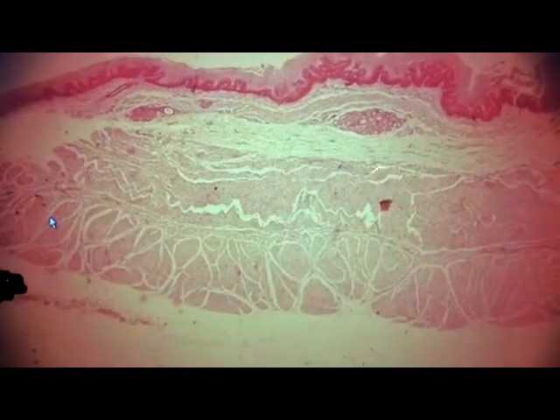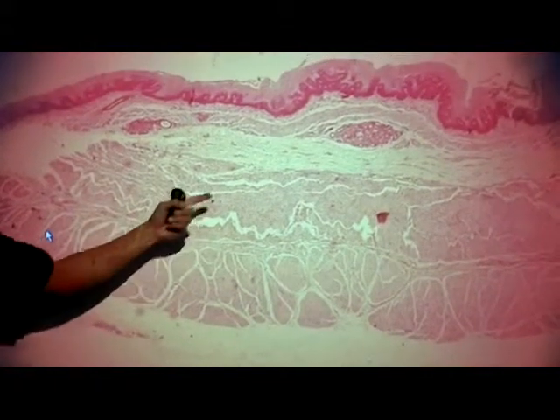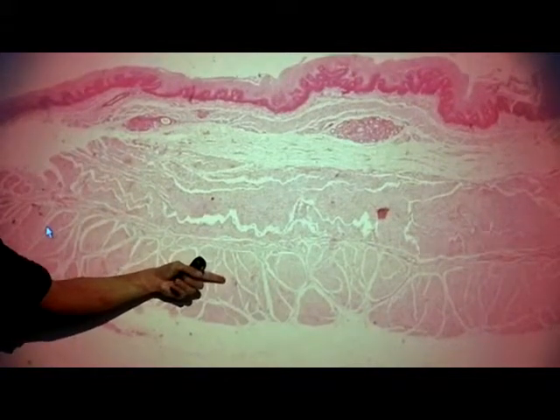This is submucosa. What are these two big slabs of prime rib? Yeah, it's muscularis externa. The inner circular layer, the outer longitudinal layer. Okay. Let's take one more look at a higher magnification and we'll move on.